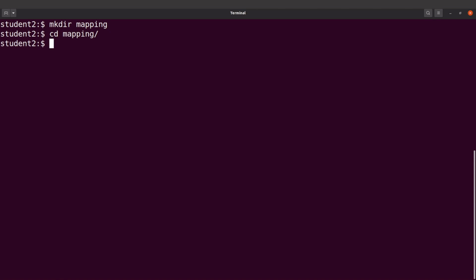As I'm here, I'll first create a script that I'll use for downloading the files. I'll also create a text file which has all the links that I'm going to use to download the files. So first of all, let me create a text file in which we will place the links. I'll say nano links.txt. I'm using the nano text editor, but you can use vi or any text editor for that matter. It's fine.